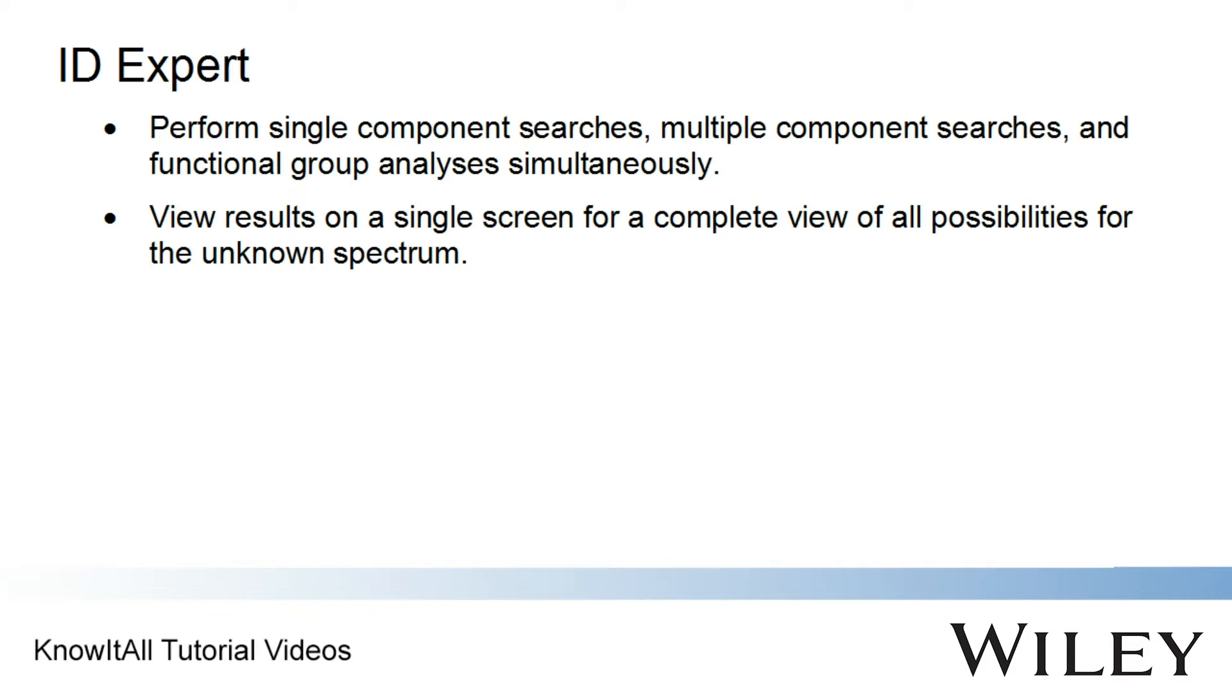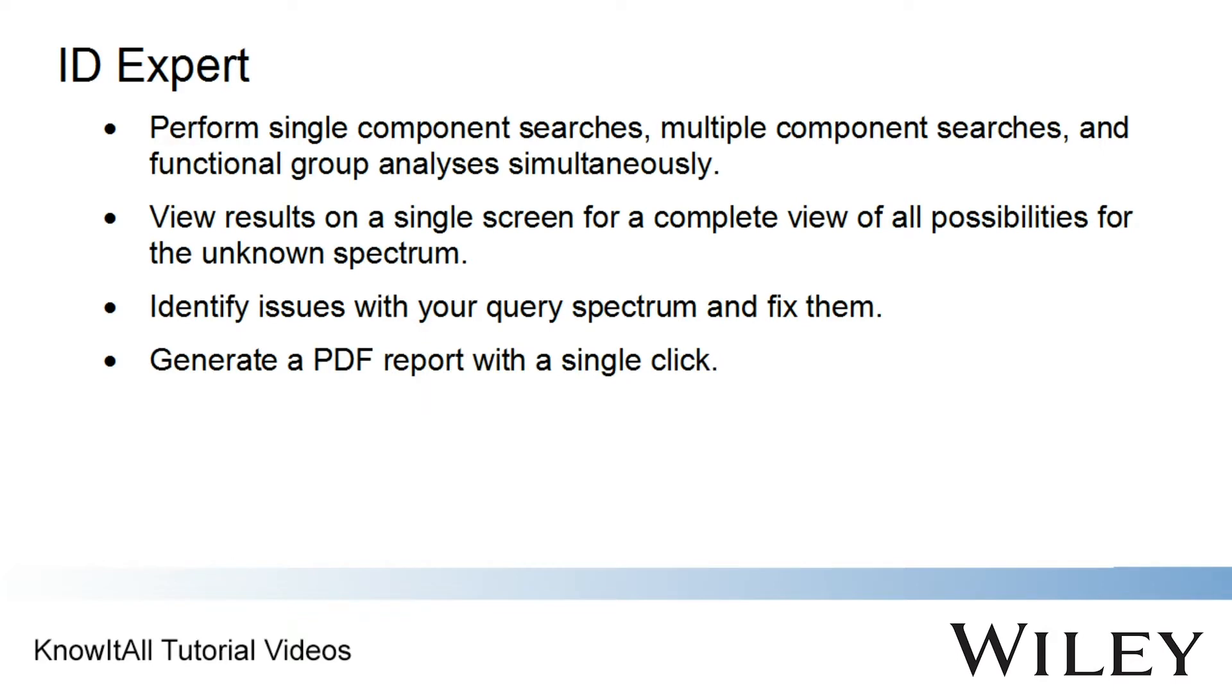Results are then summarized on a single screen. Know-It-All uses its built-in spectral intelligence to identify problems with your spectrum and suggest how to fix them. Once you identify the spectrum, generate a PDF report with a single click.